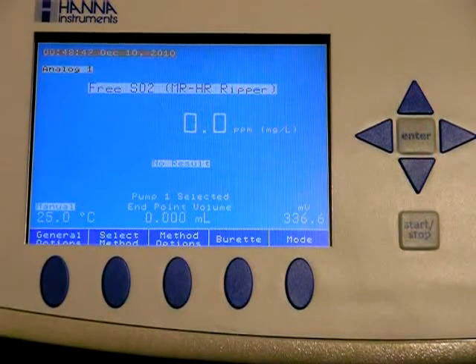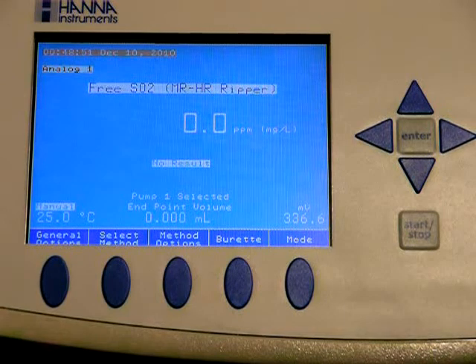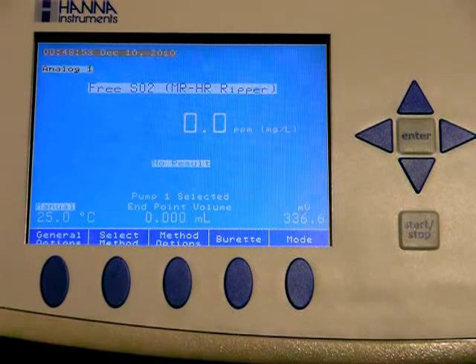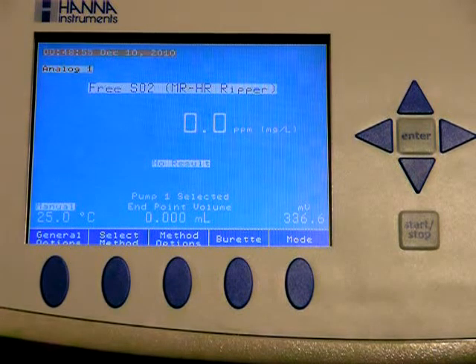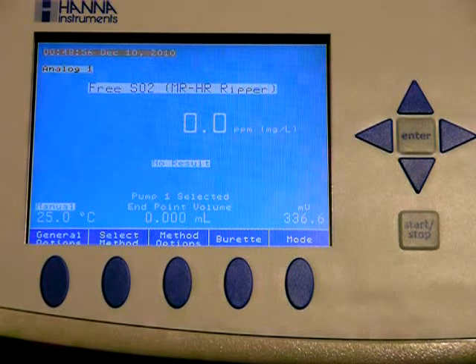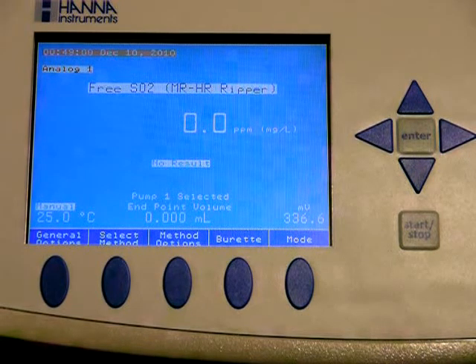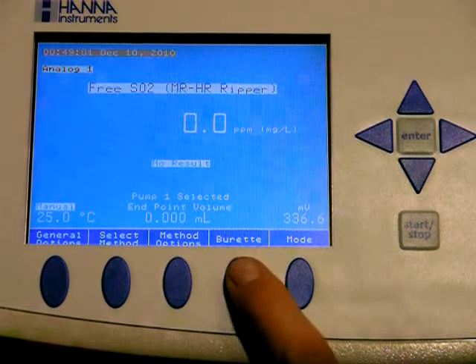Welcome back to Hanna Wine Labs. I'm going to go over the pump and burette feature on the 902C Auto-Titrator. When you're in titrator mode, one of the soft keys will be for the burette.